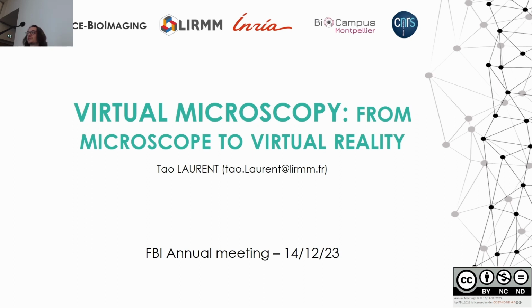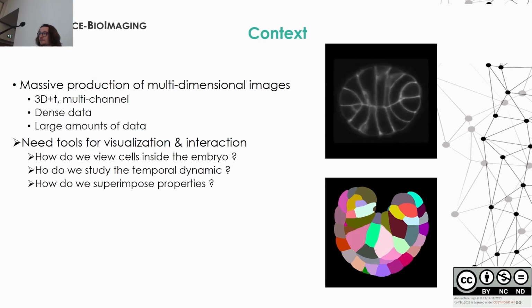I'm Tao. I'm an engineer in Montpellier, and I'm going to talk to you about virtual microscopy, which is a project in which we try to help biologists take their data from the microscope to virtual reality.